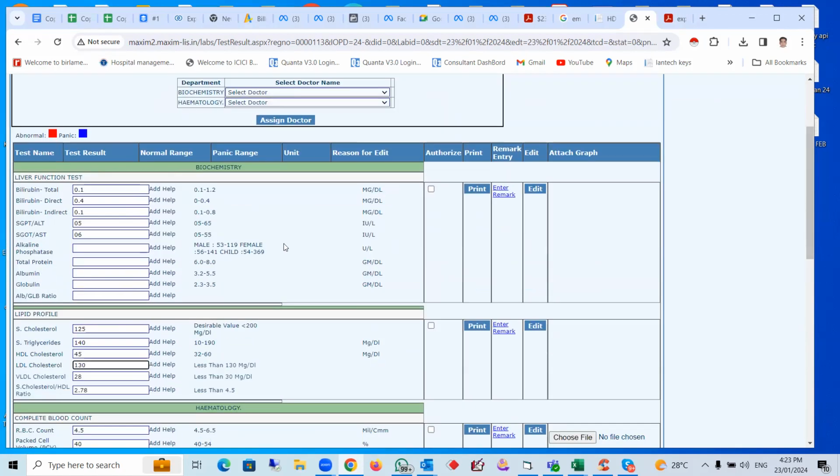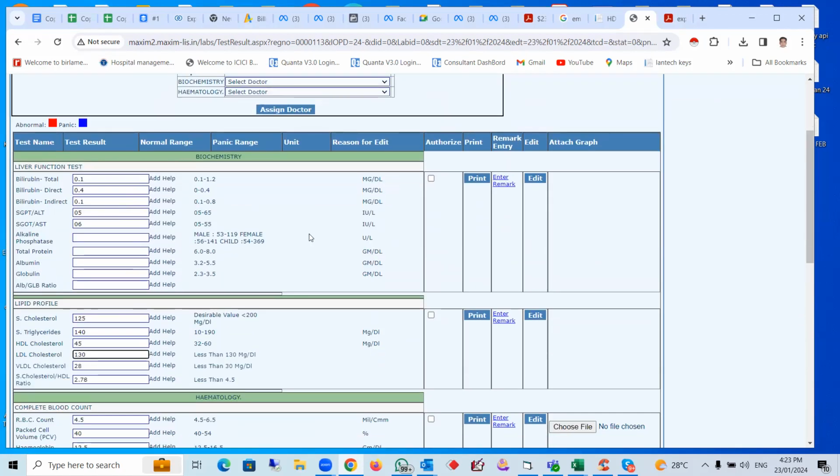Okay. So it is only the formula. If the formula is missing, it will not give the value. So you can always add or modify the formulas and it will calculate. Your work will be automatic, the calculation will be done. For whatever new parameters are introduced by you, you can have the formulas created. Okay. So this is done.